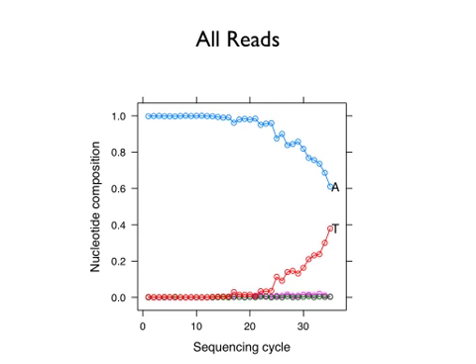And if we didn't actually bother to make this plot where we're plotting against cycle, we wouldn't have seen this. We would have just seen, oh, there's like 20, 30% T's, maybe not 30, but 20% T's and 80% A's. That might be a SNP, but it's within the binomial error.